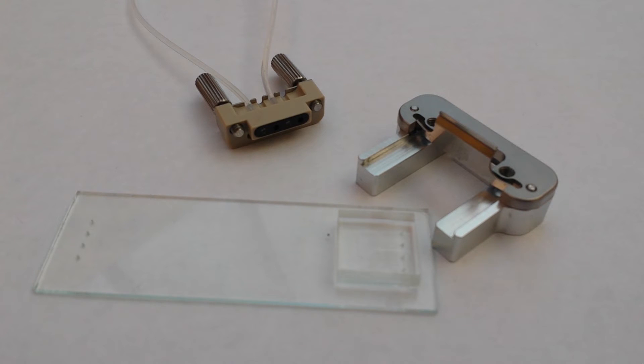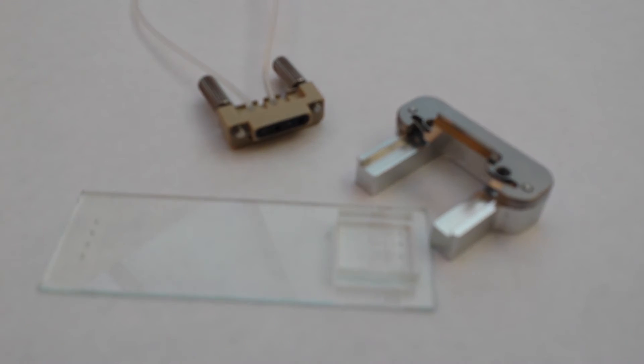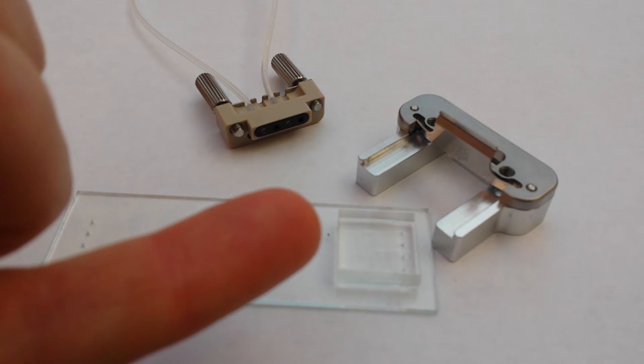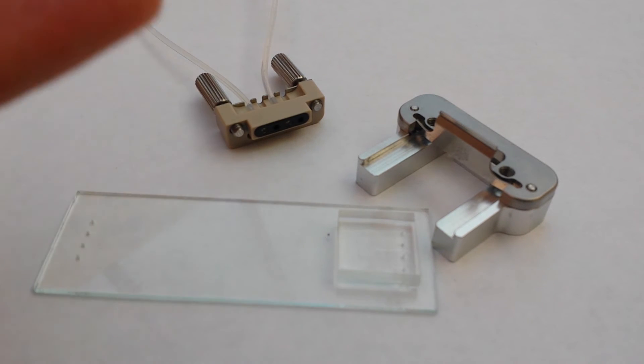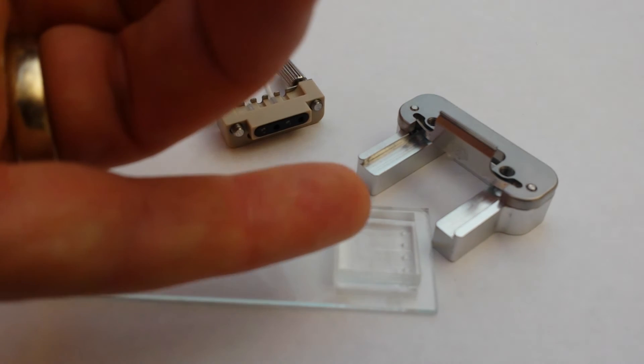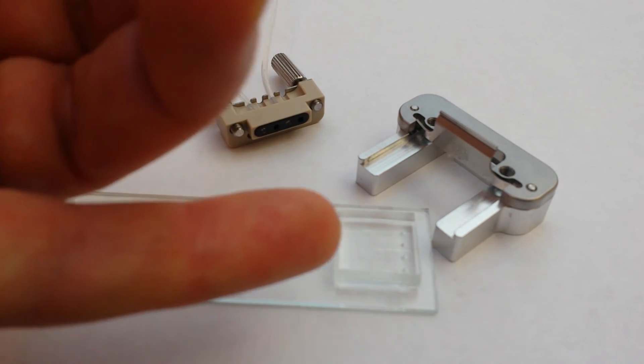The PDMS chip is designed by you. The slide, the connector, and the mounting block are all provided by Dolomite. That's a good thing because the intellectual work should go into the PDMS part — that's where the novelty is. The connectors are not novel. I'm a very strong advocate of standardising on a connection type and letting companies like Dolomite provide the connectors, while scientists and engineers be creative in the PDMS part.